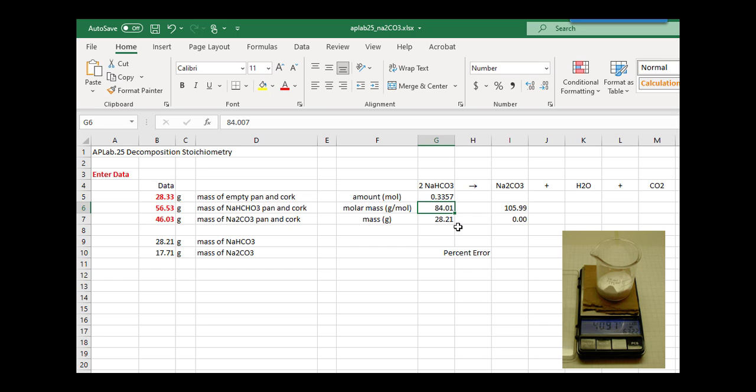Now I had 4 significant digits here, and my actual molar mass of the sodium hydrogen carbonate is 84.007, but the 4 sig digs is all you need. And my answer should be 4 sig digs. Now, if you wanted more than that, which wouldn't really be accurate, you could change the view of this decimal. But I really think 4 is about the best we could do, judging from those fluctuations because of the hot pan.